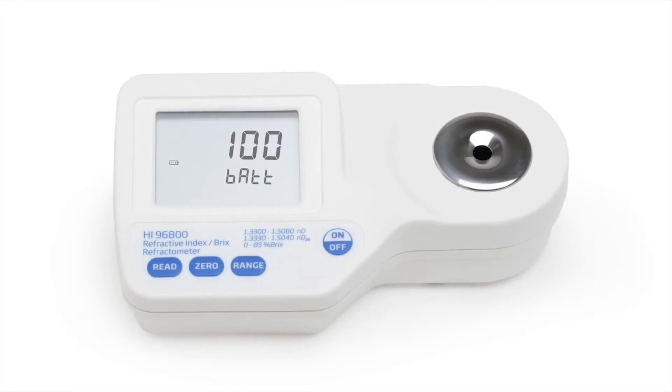When the meter is first turned on, the screen displays the remaining battery life as a percentage. The display will then show four dashes indicating that it is ready for calibration.